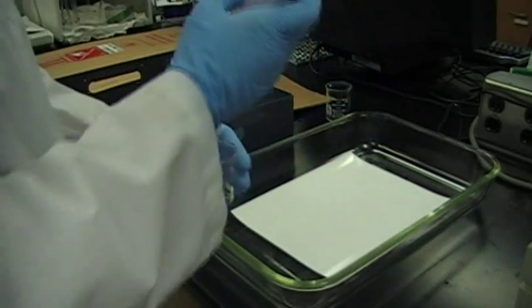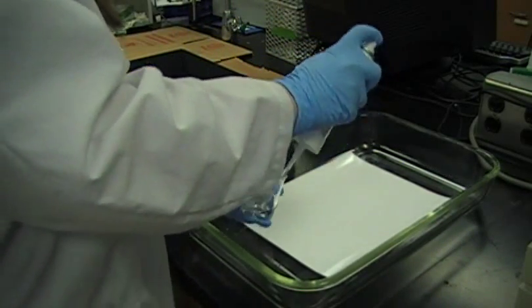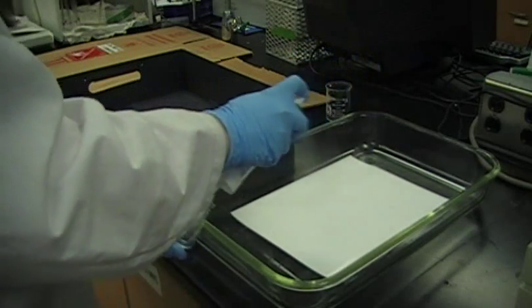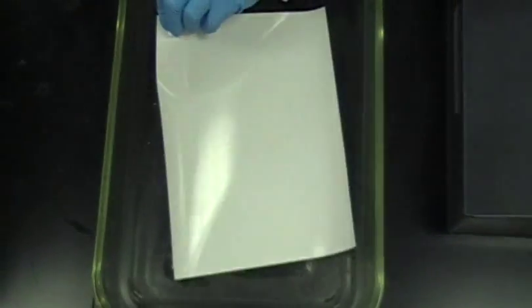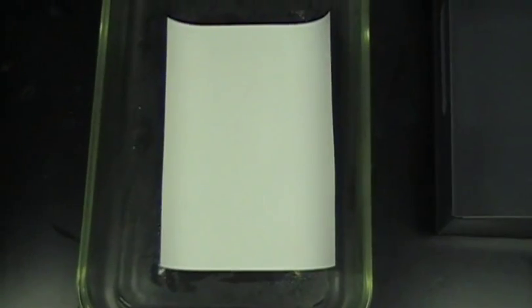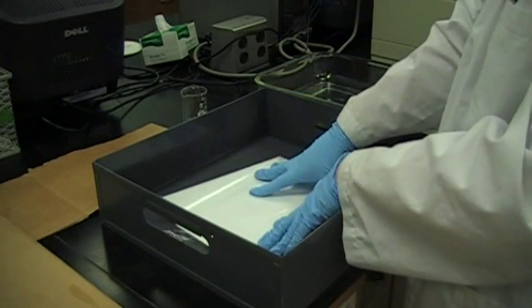To begin the nitrate test, a piece of photographic paper is placed in a shallow pan and sprayed with sodium thiosulfate on both sides, saturating the paper. Excess thiosulfate is then washed off in a water bath.